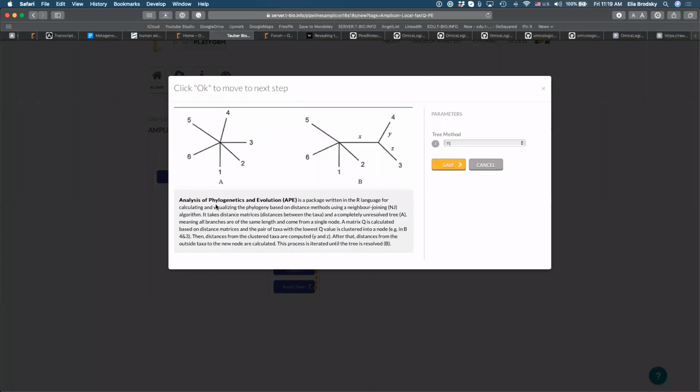So first of all, APE stands for Analysis of Phylogenetics and Evolution. So why are we using APE? What are we trying to understand the phylogeny of? What do you think we're trying to analyze here? Yeah, relatedness of what?